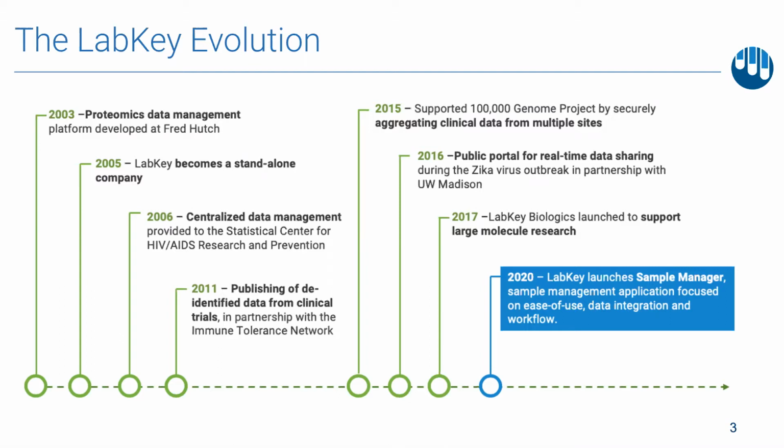They continued expanding by creating a scalable, centralized data management tool for the SHARP consortium, capturing and integrating study data. Labkey then continued to improve the study module for ITN by providing the ability to publish and share de-identified clinical trial data. During this time, Labkey started supporting other scientific data types such as flow cytometry, NAB, Luminex, and other assays.